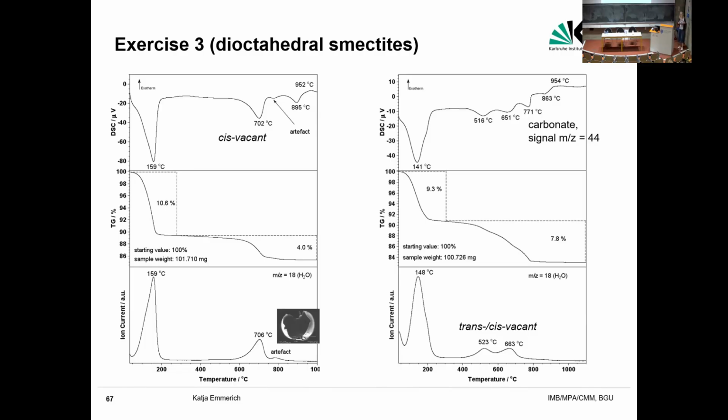That's why I always tell my students, if you don't perform the measurement yourself, please ask to get the samples back after thermal analysis was performed, because it took us also a while to find the solution of this small peak. When we had a look at the sample after thermal analysis, we saw the spheres. They have a diameter of already 1 or 2 millimeters, so you can recognize them just by your eyes. If you have some peaks that you cannot explain at high temperatures, it's always worth to have a look at the sample after thermal analysis was performed.